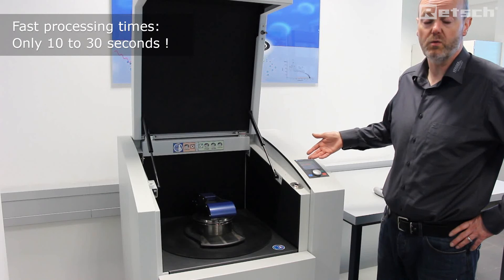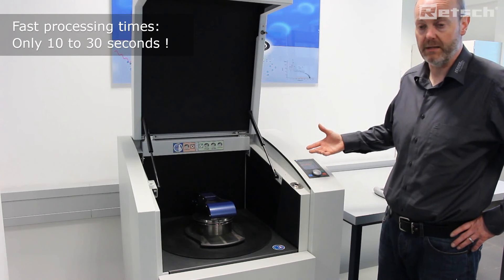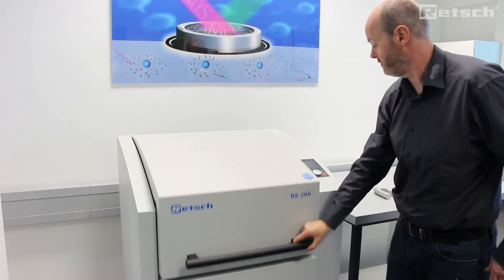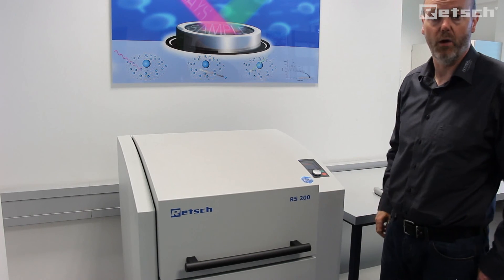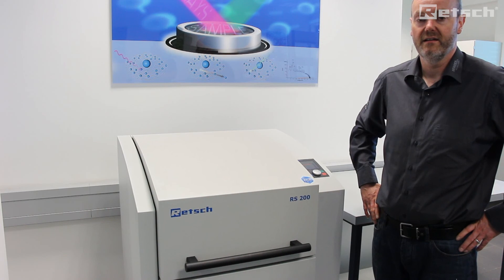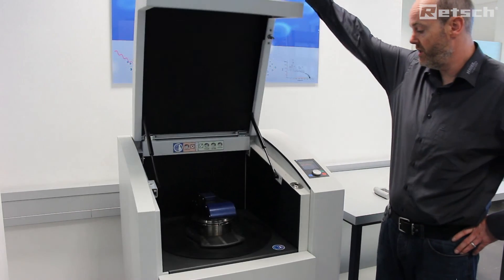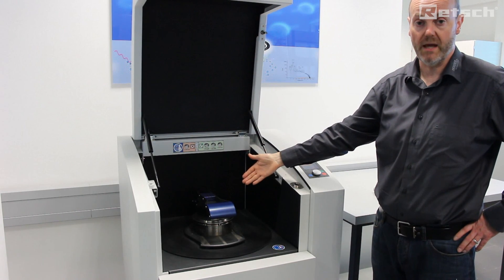Typical run times are between 10 and 30 seconds, as it is very rapidly prepared. We simply close the lid and press start and away we go. Once the milling cycle has completed, we simply open the hood and remove the grinding set for collection of your milled sample.